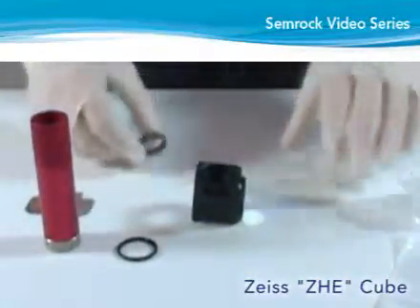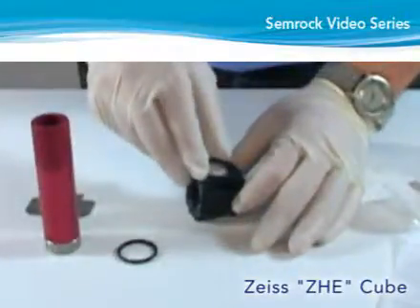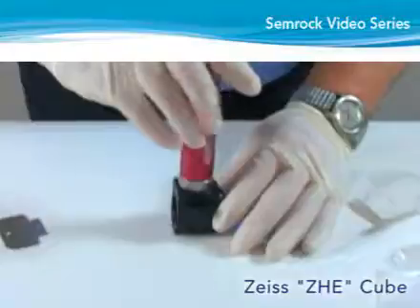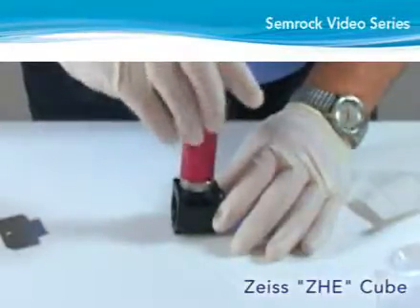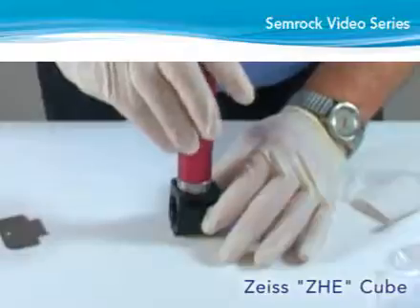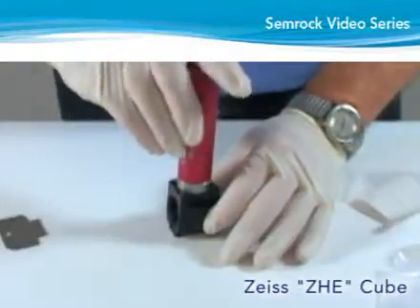Orient the exciter with the arrow on the side of the filter pointing towards the cube, and then place inside the exciter mounting hole. Insert the retaining ring with the open side facing the exciter mounting area of the cube. Following a similar procedure used for mounting the emitter, begin screwing the retaining ring clockwise, but be careful to avoid cross threading. Using the spanner wrench, carefully turn the ring while observing its position in the threads and keeping the ring level. Tighten the ring snugly against the exciter filter.